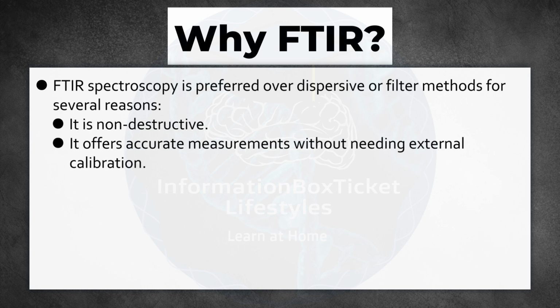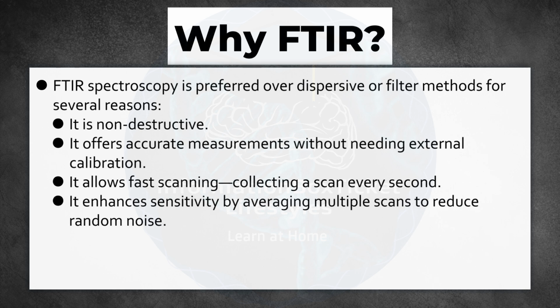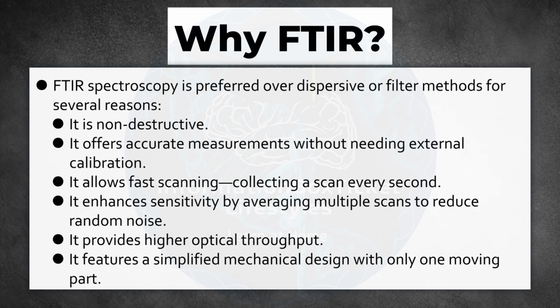It offers accurate measurements without needing external calibration. It allows fast scanning, collecting a scan every second. It enhances sensitivity by averaging multiple scans to reduce random noise. It provides higher optical throughput. It features a simplified mechanical design with only one moving part.